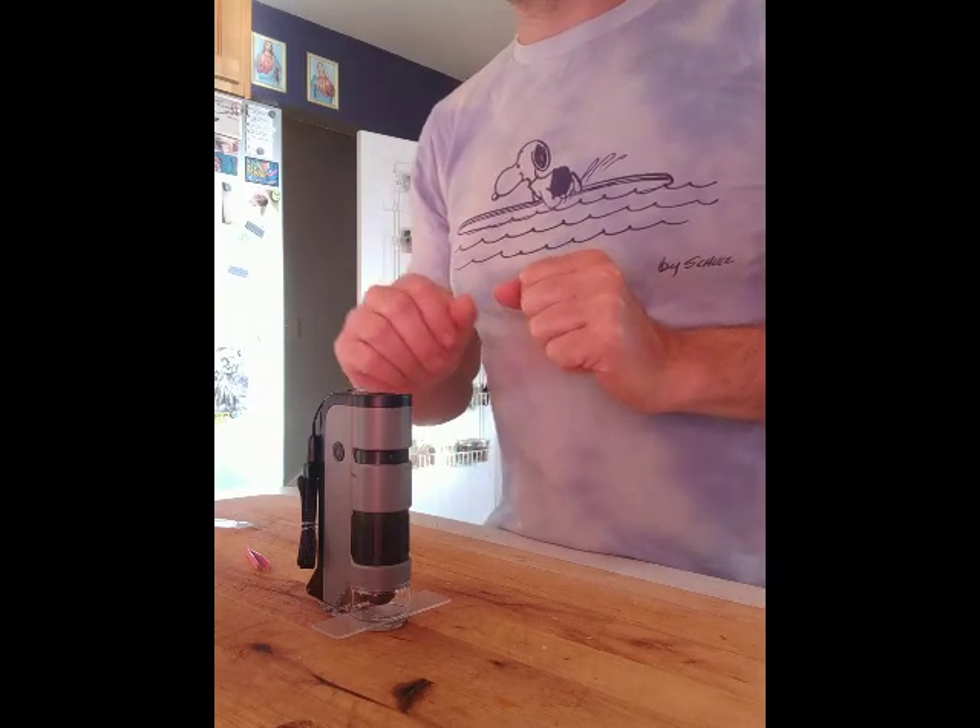Now we'll get some Zygomycetes up close. This little microscope is pretty annoying to figure out how to use with your phone, but once you get it, it's not bad. Pictured here we're looking at Zygomycete hyphae — it's easier to see with just your eye but for taking pictures. They're coenocytic; they don't have septate hyphae.